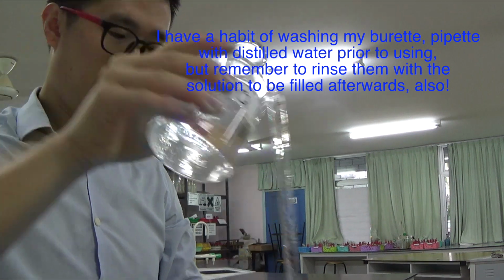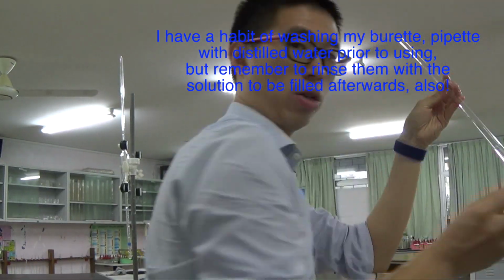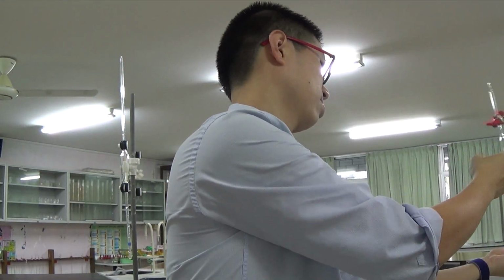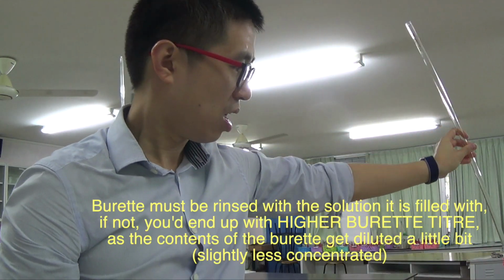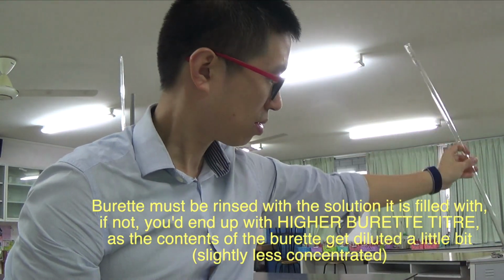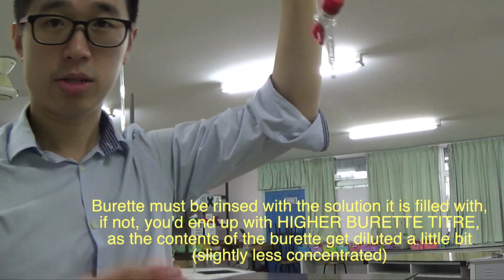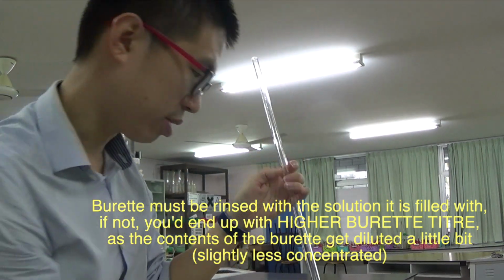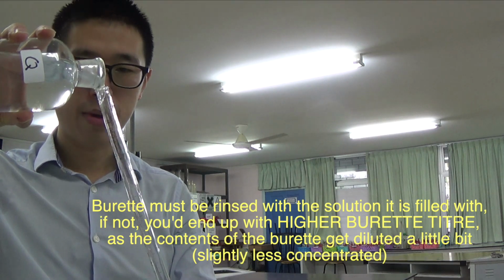Oops, I just remembered I haven't opened the tap at the bottom yet and I ran out of my solution. So open the tap at the bottom. So the bottom is now rinsed with the solution. Throw it out from the top. Open the tap again to remove the washings into the sink. Okay, so now it's almost dry, but we know that this is the sodium thiosulfate already, so we are reasonably okay. I'm just going to quickly fill my burette.